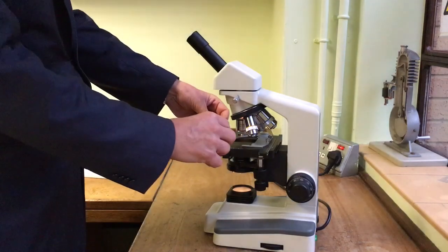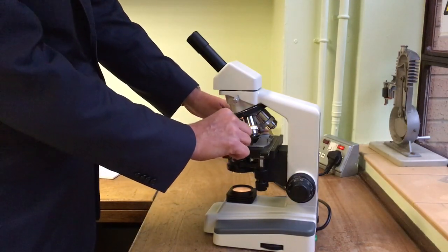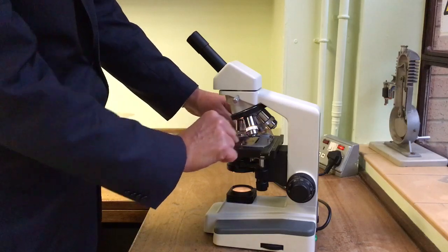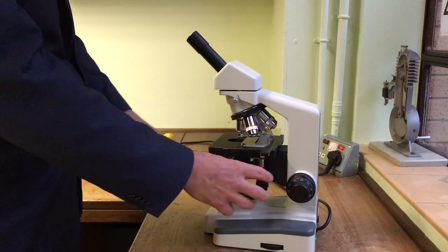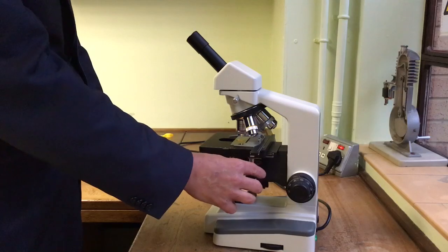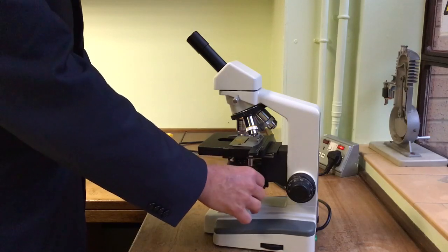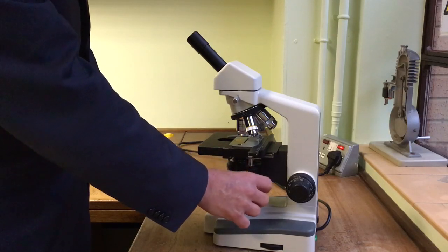Placing the microscope slide into the clip. The light shines through the slide so that I can view the cells. I'm using this to maneuver the slide around to find the bit I like.